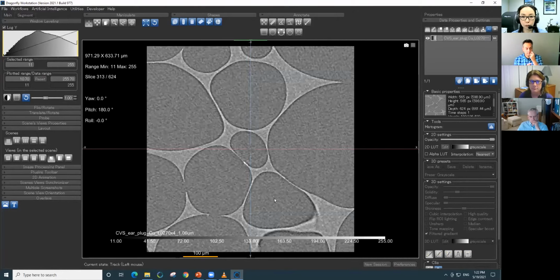Now, the question Angela is going to ask you is, what would be the best segmentation technique to use? Okay, so for this poll, you've got 3 options. Would you use machine learning? Would you use manual thresholding? Or would you use Otsu binarization? I'll give you a few seconds to vote for this.